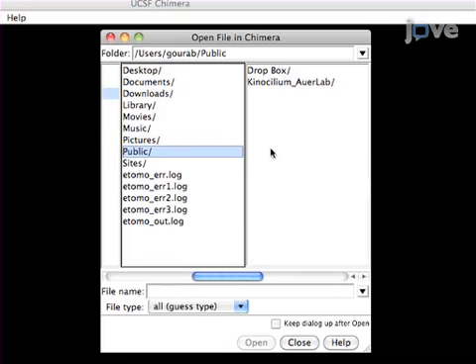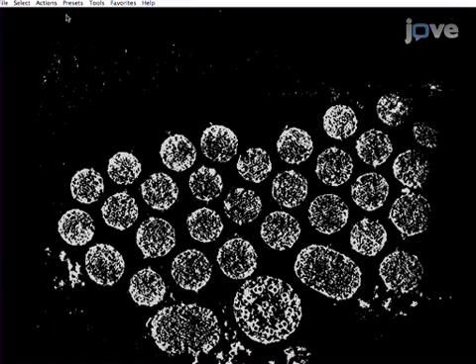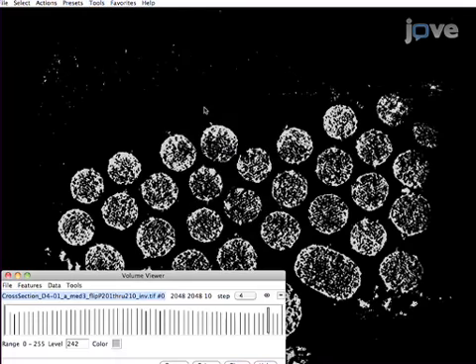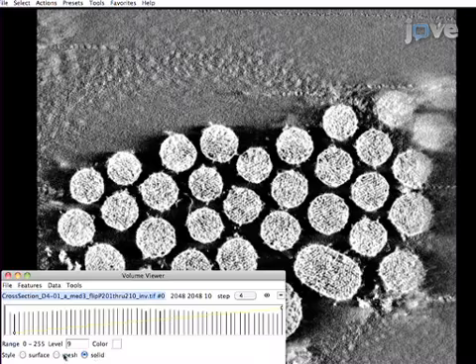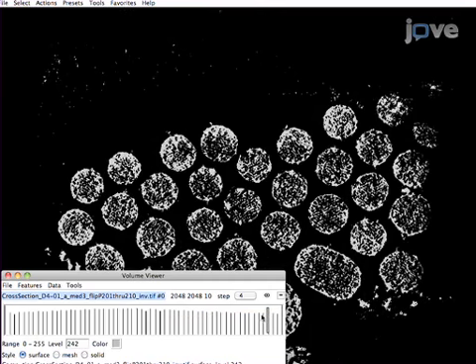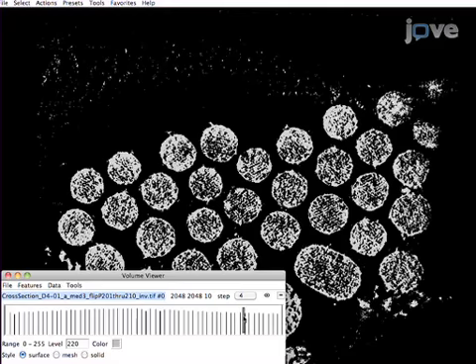First, select File and Open to pull up the Open File dialog. Navigate to the file location of the desired map. Next, pull up the volume viewer and select Features, Display Style to display data with different rendering styles. Adjust the threshold for the display by dragging the vertical bar on the histogram in the volume viewer window.